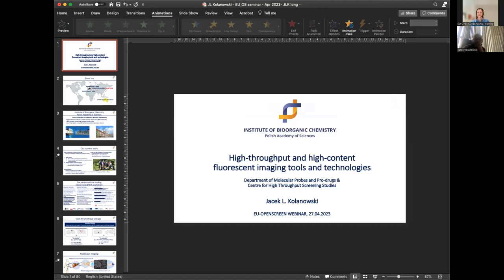It was a very, very nice presentation. I learned a lot. I just wonder about the probe that you were mentioning for distinguishing between iron 3 and iron 2. I have seen some probes. Some of them are commercially available.